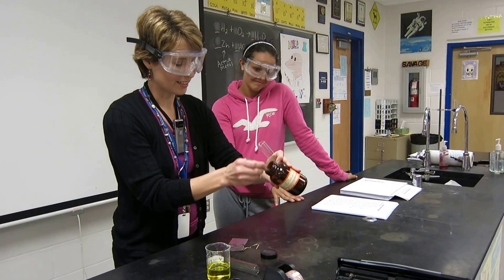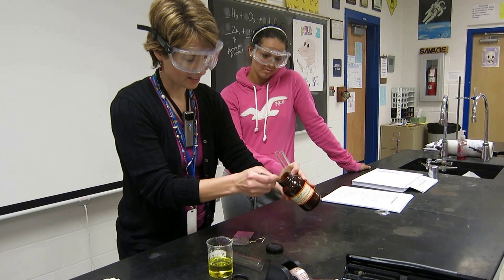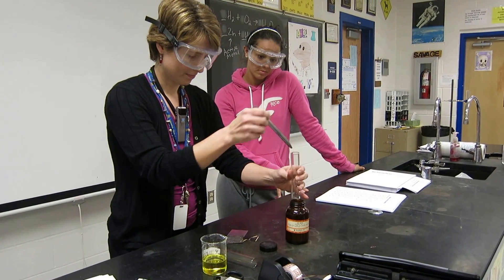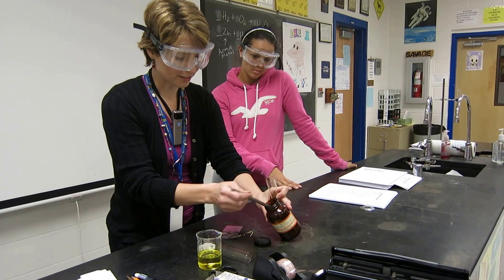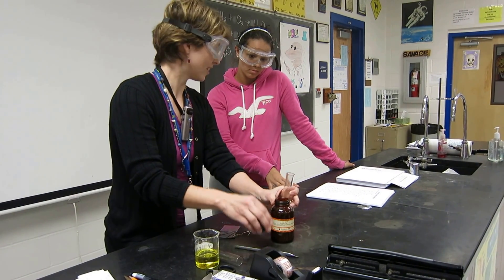So first we're going to put some zinc in here. This is what they call mesh zinc — it's like little granules of zinc. Just a little bit. It's also called an active metal because it reacts readily, especially with hydrochloric acid.